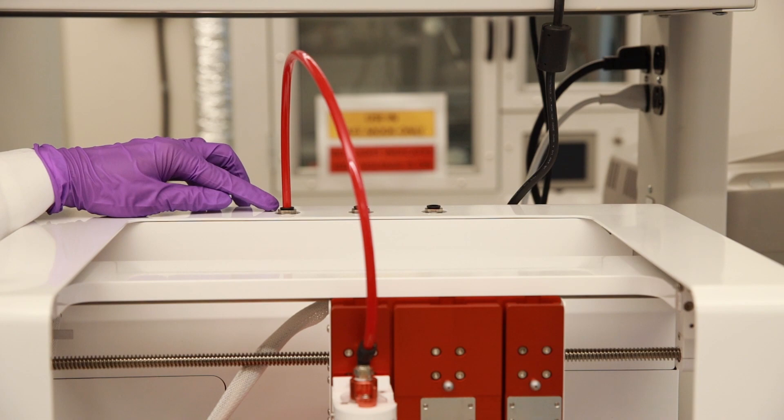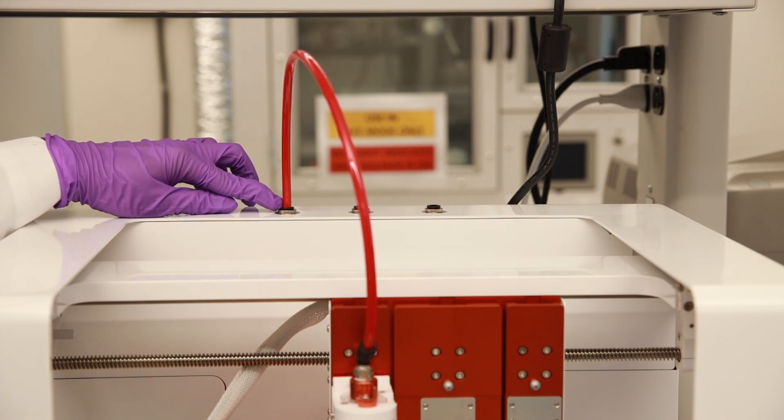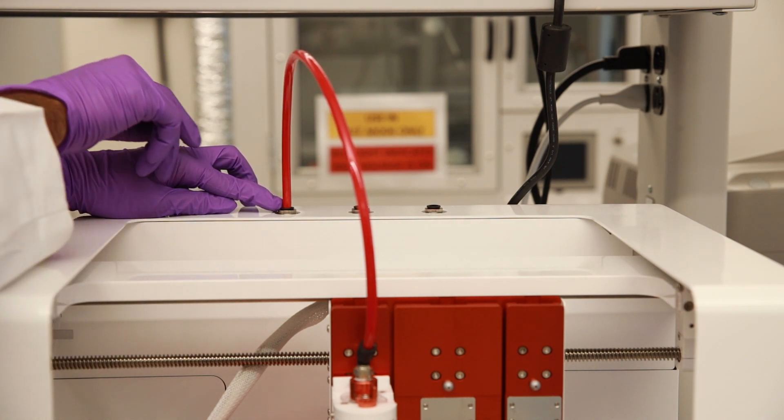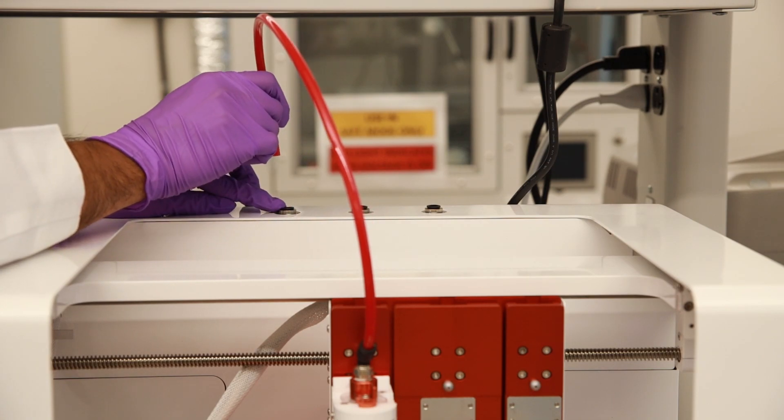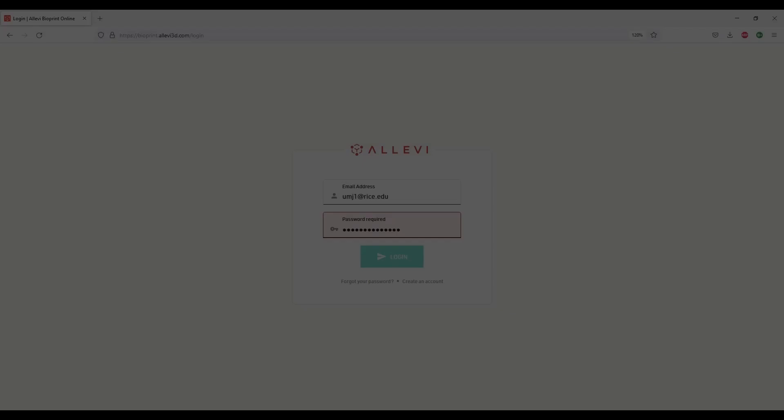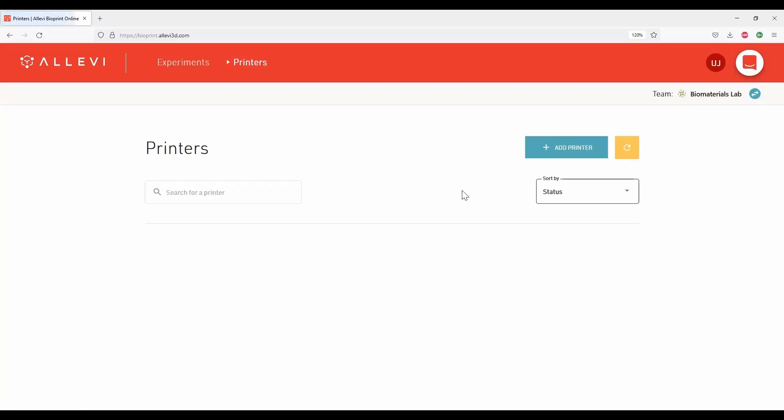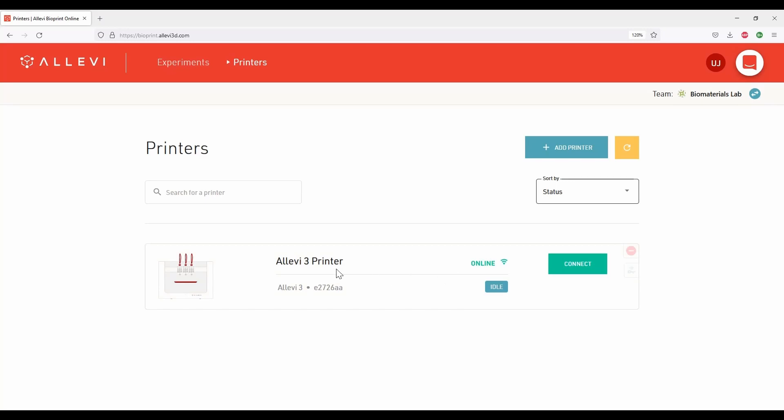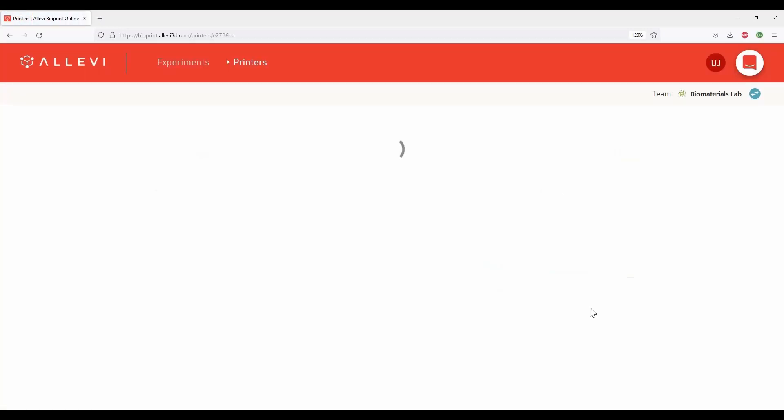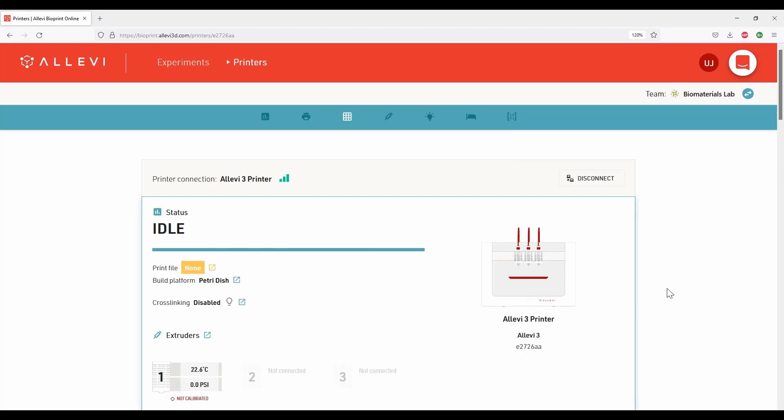To remove the air compressor line adapter, press on the black o-ring and pull the line. Go to bioprint.alevi3d.com and log in with your credentials. Connect to the Alevi 3 printer that is online. This is the interface to communicate with the printer.